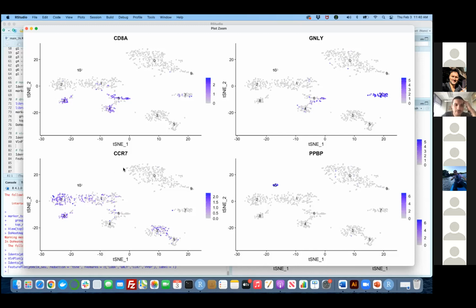And again, if I take a look at CCR7, CCR7 is up in both 2 and 8. There are some over here, but usually what you're trying to look at is where the signal has the most expression. You may see some random technical artifacts or some alignments to CCR7 in other groups, but what we are usually trying to find is where it is the most expressed, right? So I'm just probably thinking that 8 is CD8 naive, 6 is CD8 cytotoxic, and so forth. So you may still need to go with 4.